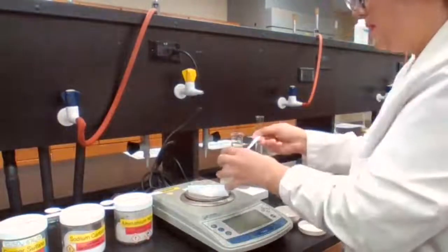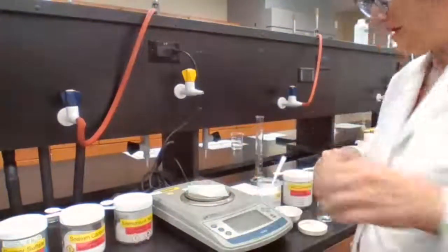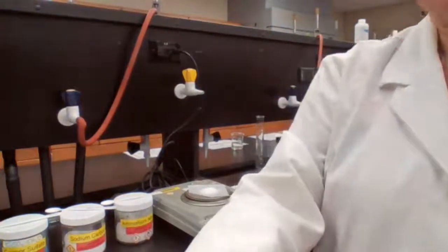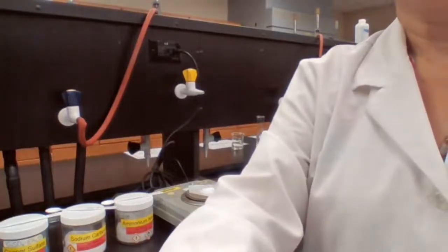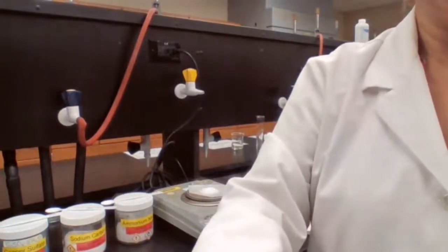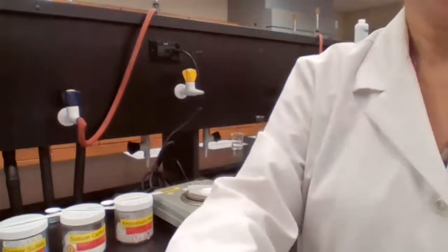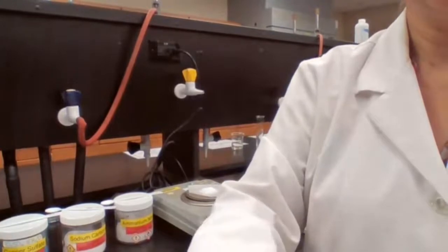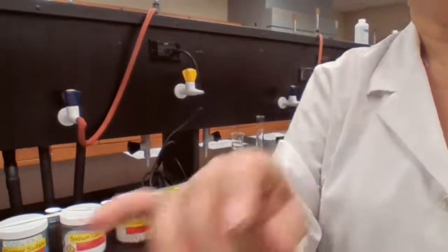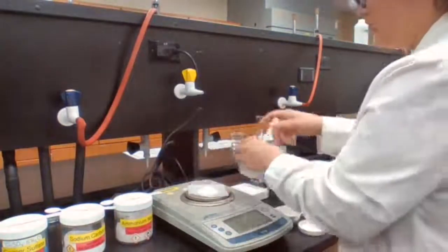I add a second spoon, so this would give me mass of 2 scoops of the salt, whatever number is, and that is 9.255 gram, mass of paper plus 2 scoops of salt. Next, as for 3 scoops, 13.706.